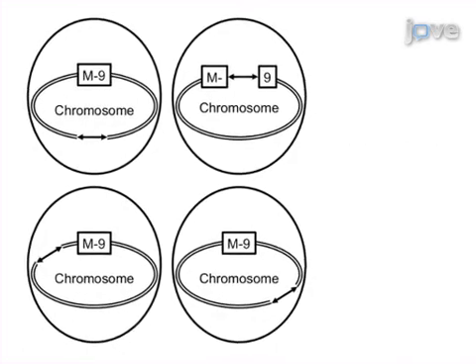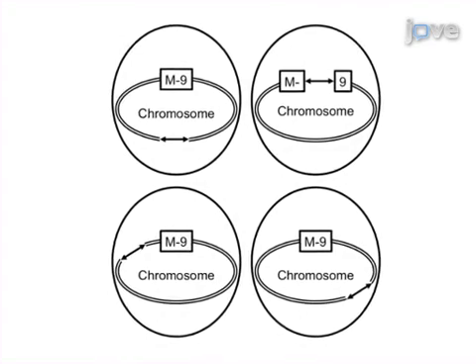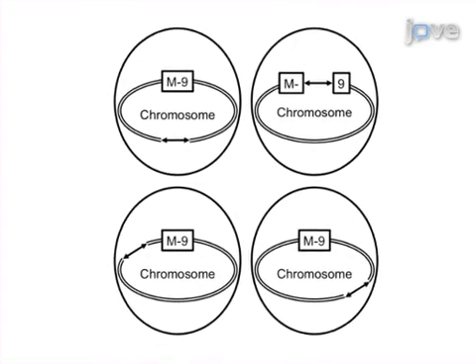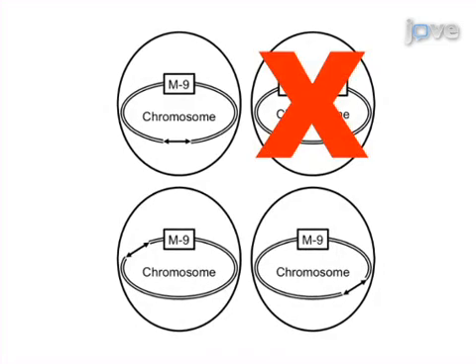Next, transformants are screened by replica plating, which identifies oxytrophs that grow on rich medium but fail to grow on minimal salts medium supplemented with glucose.